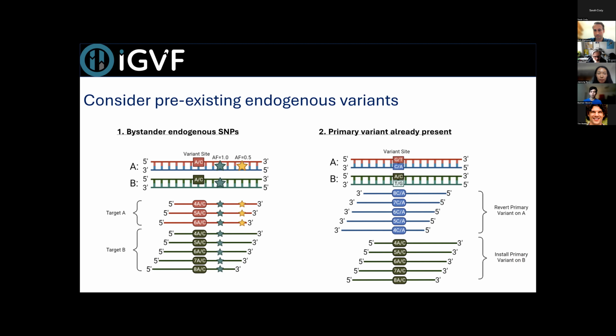So in this right illustration, say we already have the transition variant heterozygous within the cell line. So instead of an A or C, it's a G or T. We could design guides that actually revert the variant. So in this case, we would instead not be targeting the positive orientation strand, but the negative orientation strand that contains the C or A that we want to deaminate.